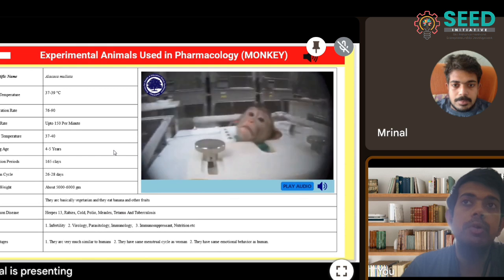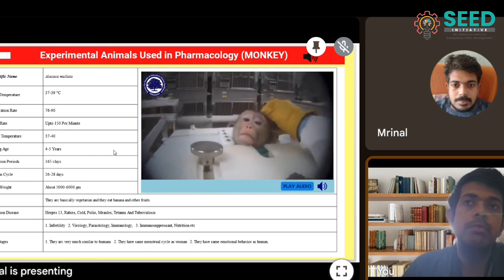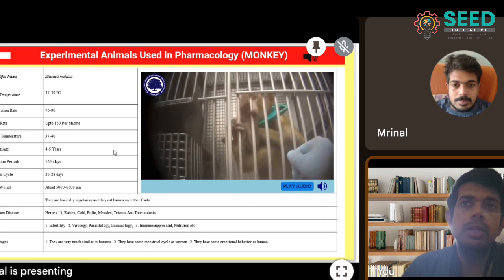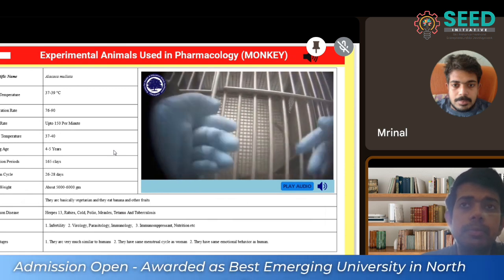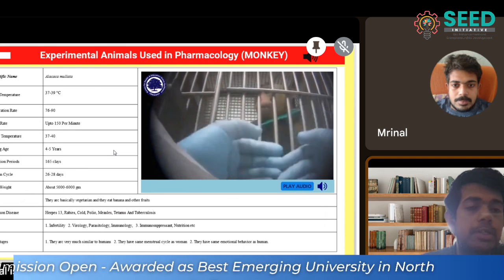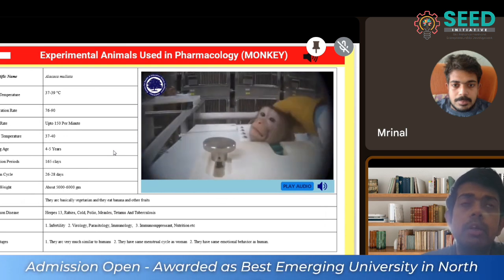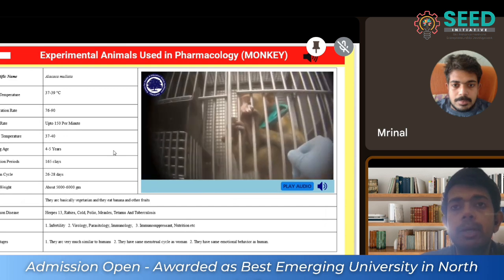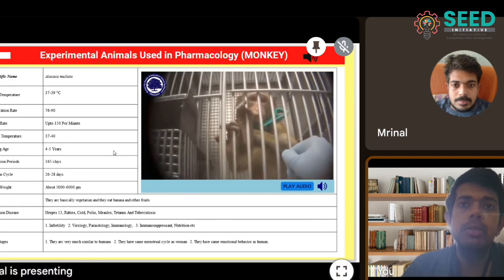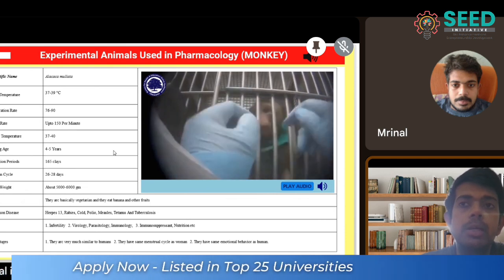Mating life is for 4 to 5 years. Gestation period is 165 days. Estrus cycle is around 26 to 28 days. Body weight is around 5 kg to 6 kg. They feed on a vegetarian diet like bananas and other fruits. Common diseases are herpes, rabies, cold, polio, measles, tetanus, and tuberculosis.